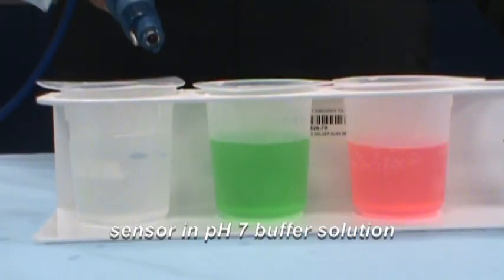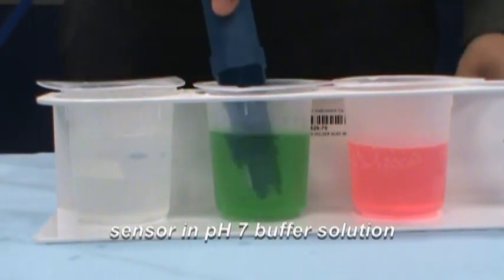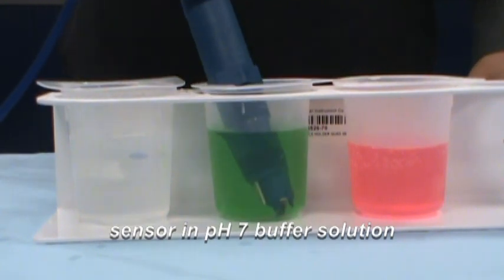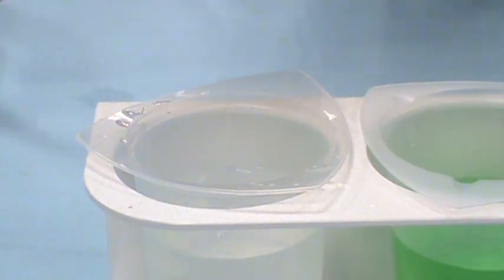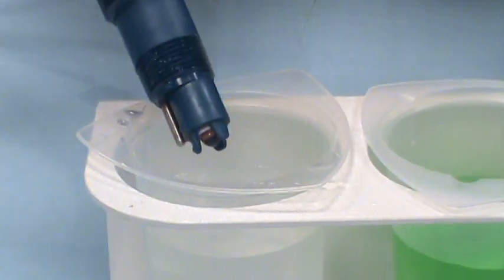Place the sensor in the second buffer solution. In this example, pH 7 buffer solution is being used. Wait for the value on the pH instrument to stabilize. Once the buffer value has been acknowledged by the instrument, remove the sensor from the pH 7 buffer solution.